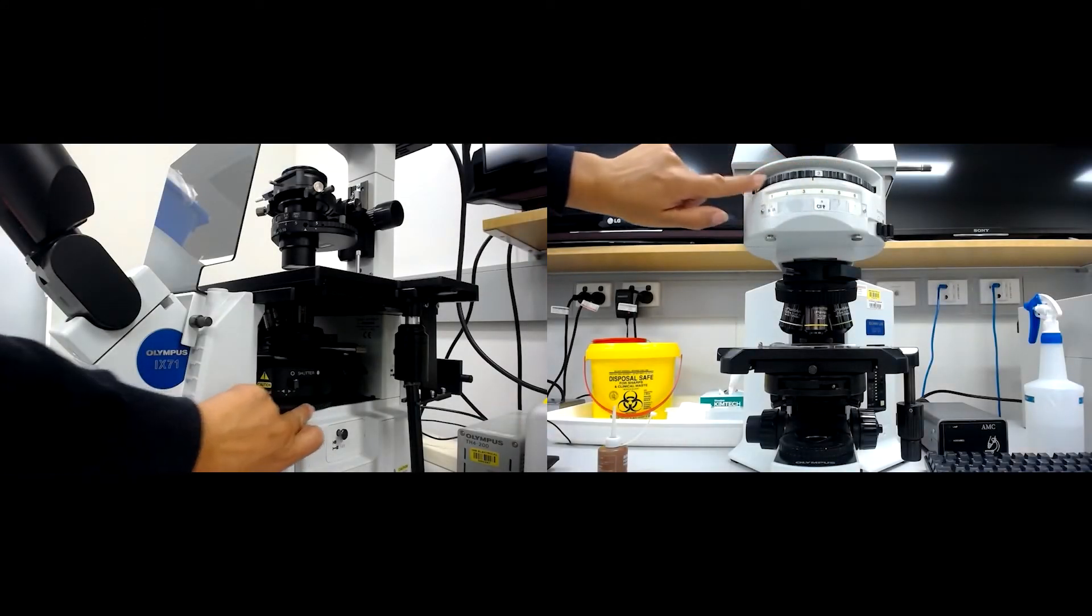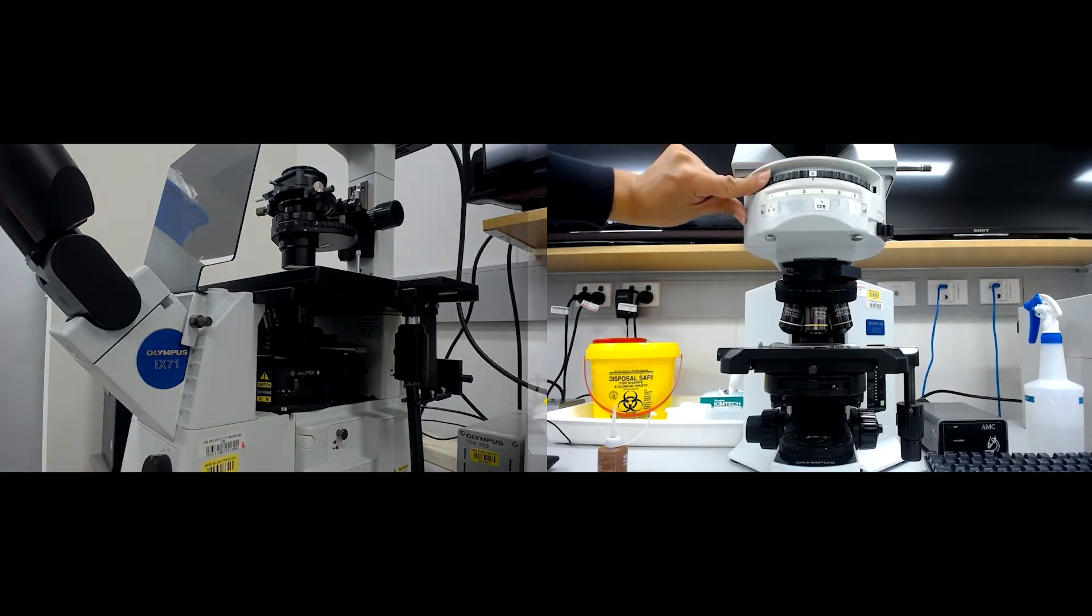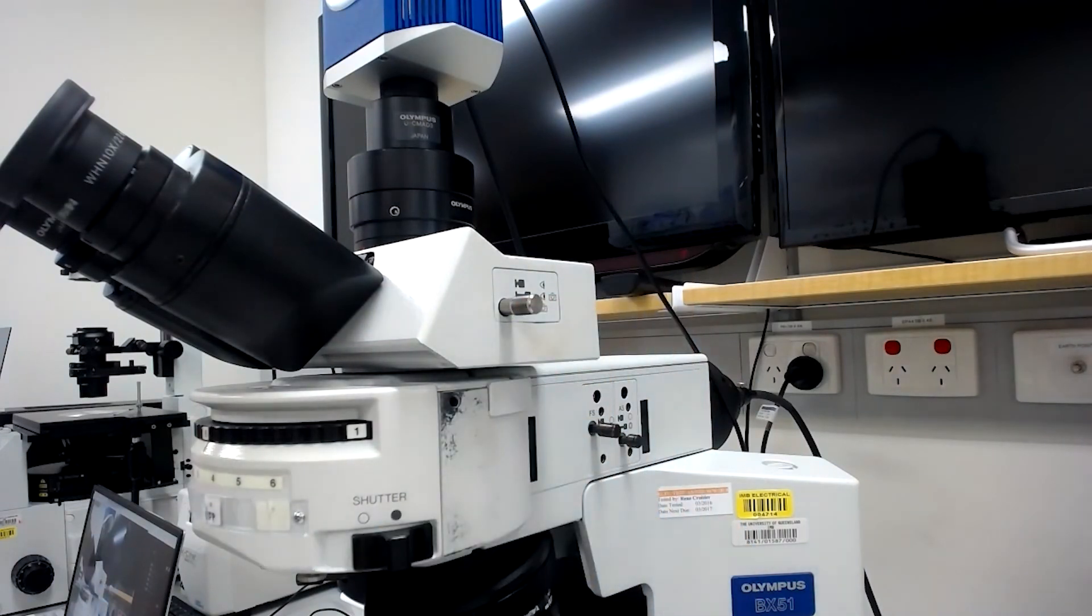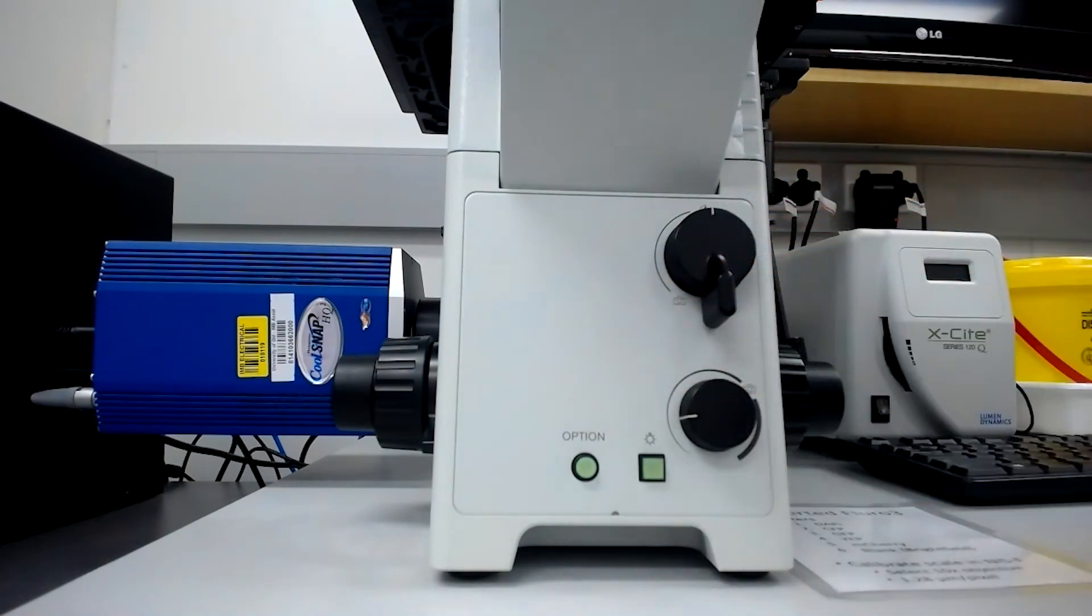Change the emission turret to an empty filter position for brightfield imaging. Make sure the light is directed to the eyepiece by moving the slider on the upright or turning the knob on the inverted.